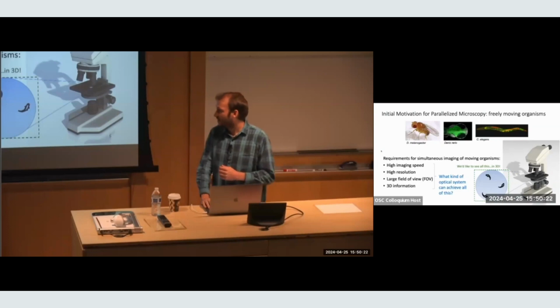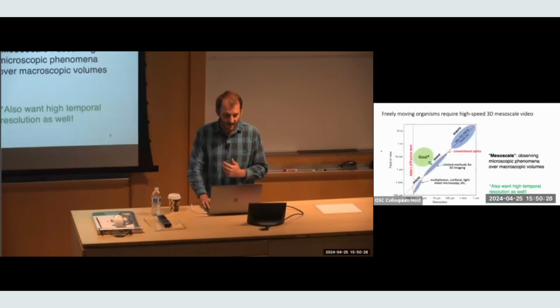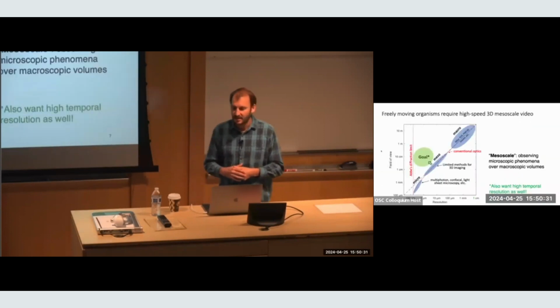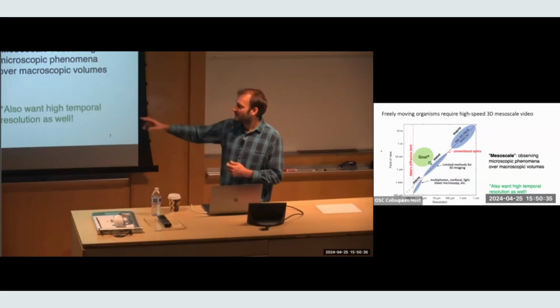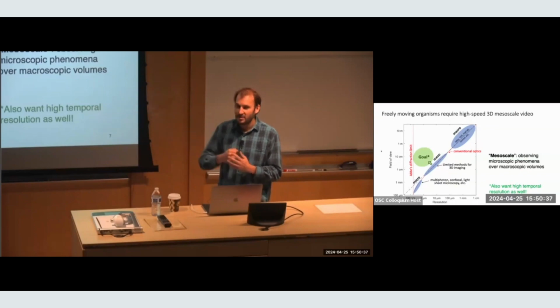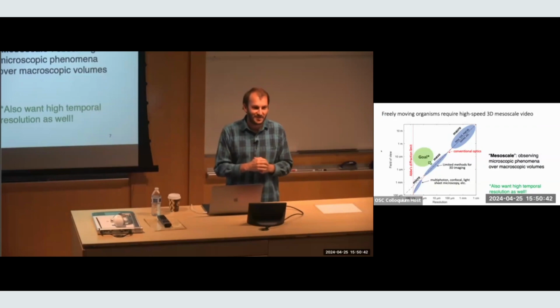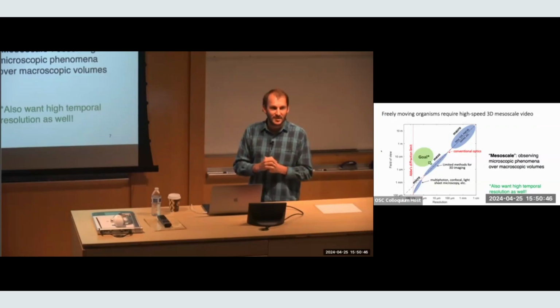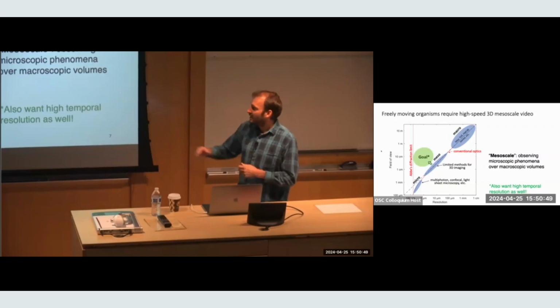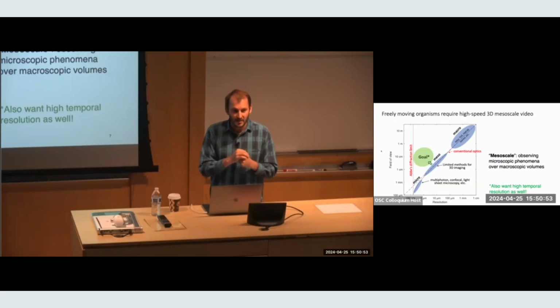And so the question is, what kind of optical system can achieve all of this? There's a number of different optical solutions. Naturally, you're probably thinking of some. But to put this in context of what exists, there are microscopes at the very, very high resolution edge of things, pushing, and everyone argues about resolutions in these super resolution microscopes, but anyways, tens to hundreds of nanometers, that can potentially image in 3D. But their field of view is very small, right? They can only see a few cells, for example.